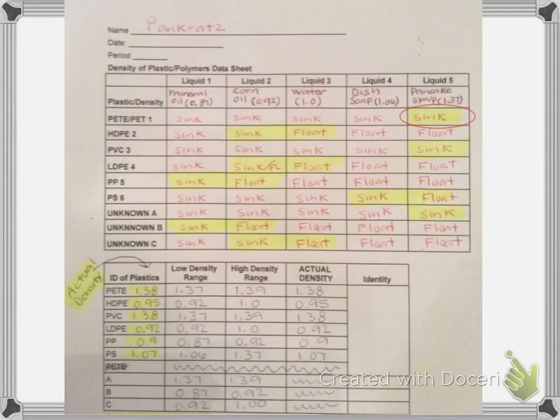For HDPE, I find that I have my sink-float there. PVC, similar to before. Excuse me. LDPE has that weird one. That's sink-float. I'm going to go ahead and count that. Polypropylene has one here. And you can do the rest on your own. So what I'm basically doing is looking for my upper and lower end. Now if you put this in order from low to high, you're going to be able to fill in the next part of your table pretty easily.